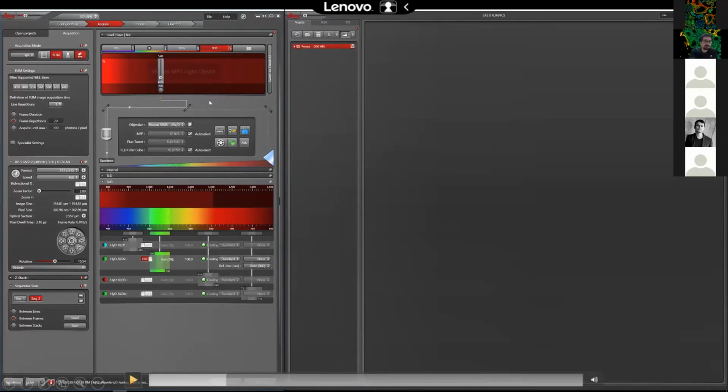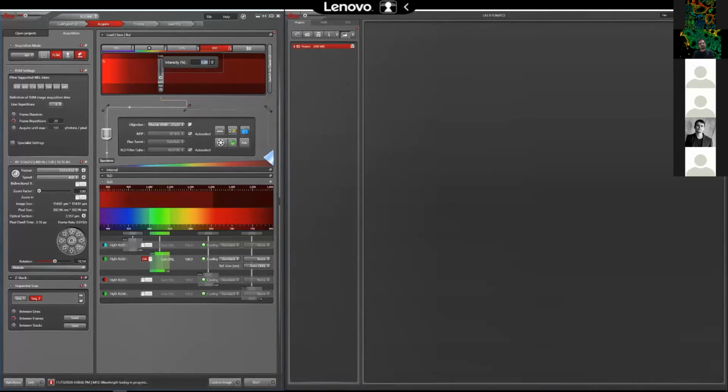But here we are not doing that. We are doing the sequential imaging: 900 nanometer for FAD and 740 nanometer excitation for the NADH. And we are using 6.25% laser power. That's the value we found. It's working quite fine, and it's still 20 repetitions.